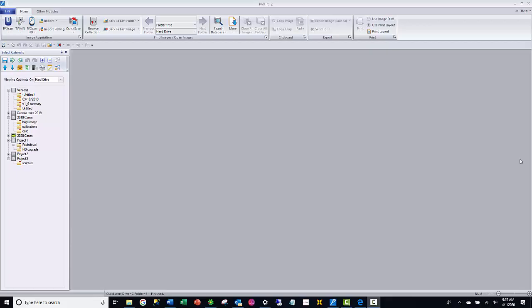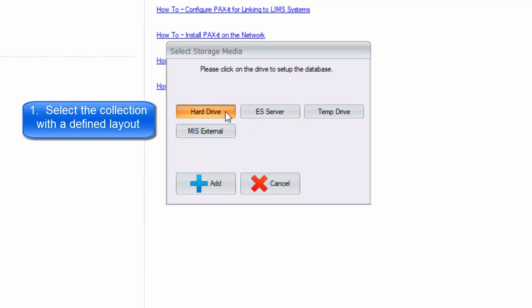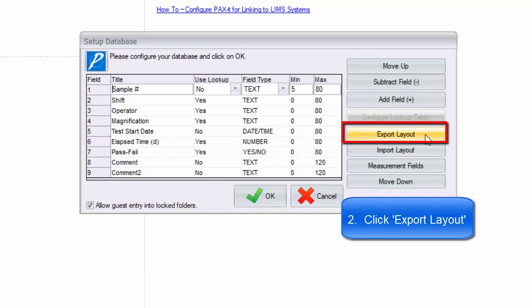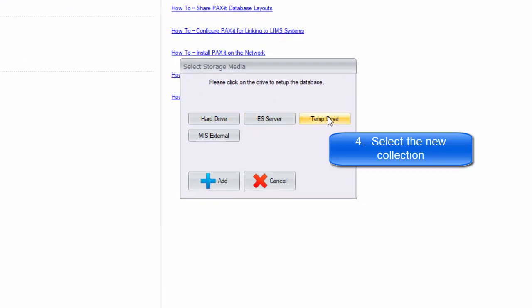It's not uncommon for more than one Paxit collection to be used on a machine or for more than one workstation in a lab to be using Paxit. If a database layout needs to be duplicated elsewhere, there is an easy process to accomplish this. Once defined, simply use the export layout function to send an LYT file to a location of your choosing, then use import layout on the other machine or drive to duplicate the entire layout in the new location.